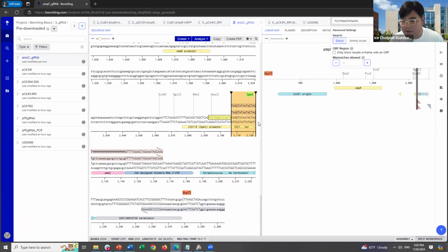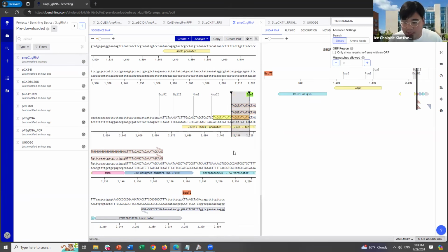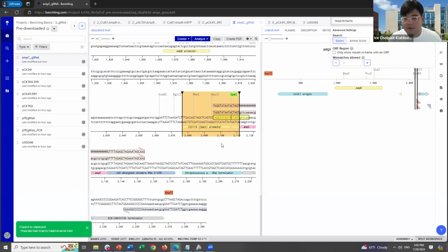So if you search for this part, you see that these two are actually the same copy. The way the assembly overhang works is that they will show this part and this part, or this part and this part, depending on how each exonuclease was working. And the final sequence would be something where you combine these overlapping sequences together.